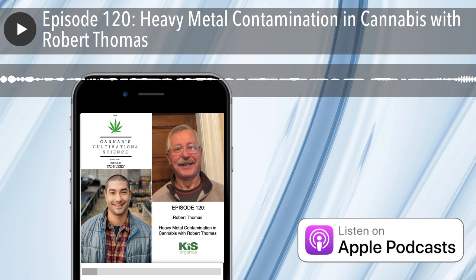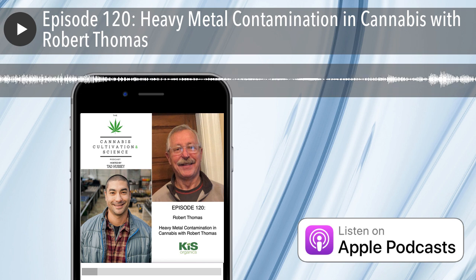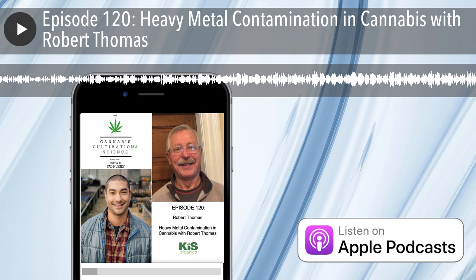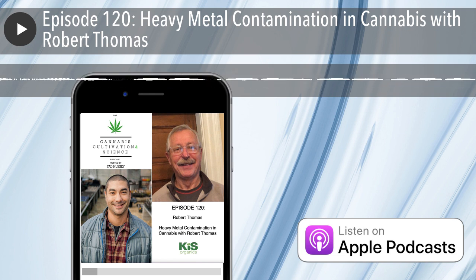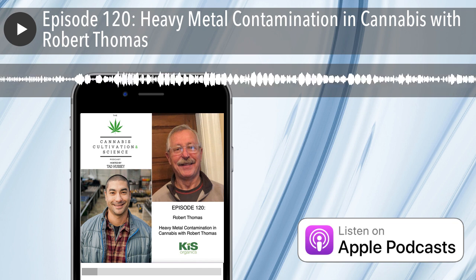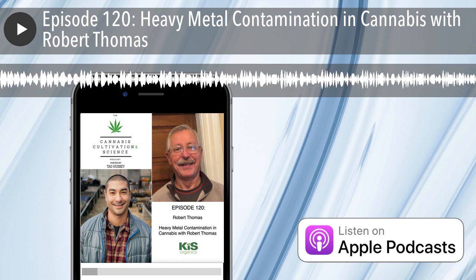We know that ASTM have come up with a standardized method for doing heavy metals in cannabis material, and they just came out with a method, and they found out that there were up to 24 elemental impurities in the standard method, because the cannabis and hemp that they use to develop the method contain quite high levels of other heavy metals which are not being monitored.